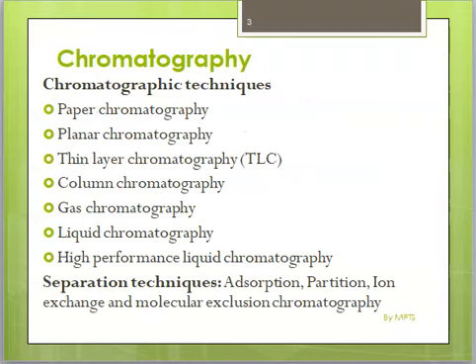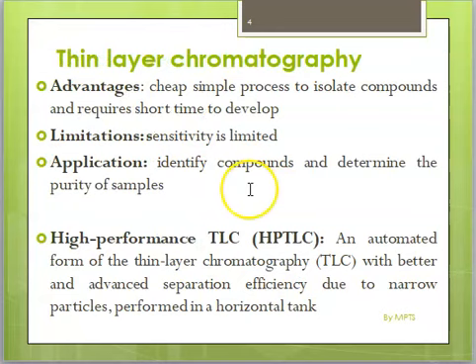Of course, we have paper and planar, which are the older methods. Then we have TLC, HPTLC, column, and gas liquid, or HPLC. And the separation techniques: one is adsorption. It could be partition, it could be ion exchange, or molecular exclusion. Molecular exclusion is based upon size.